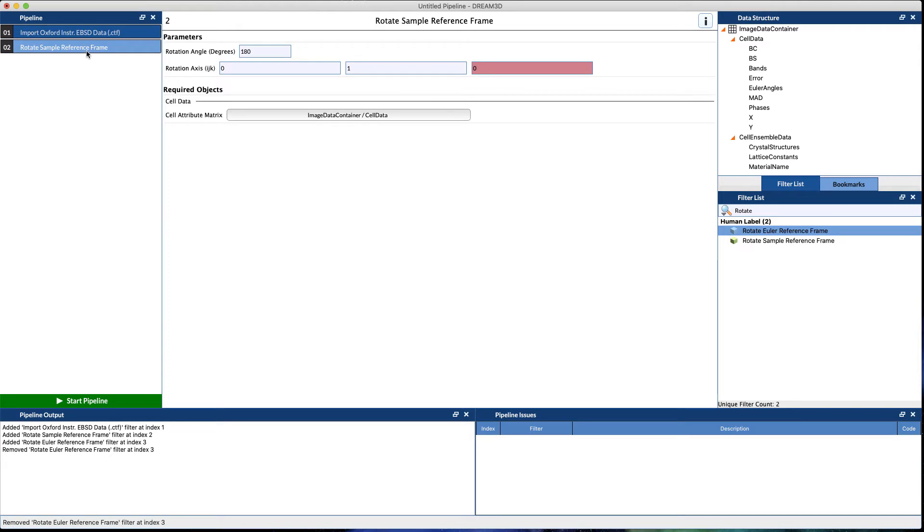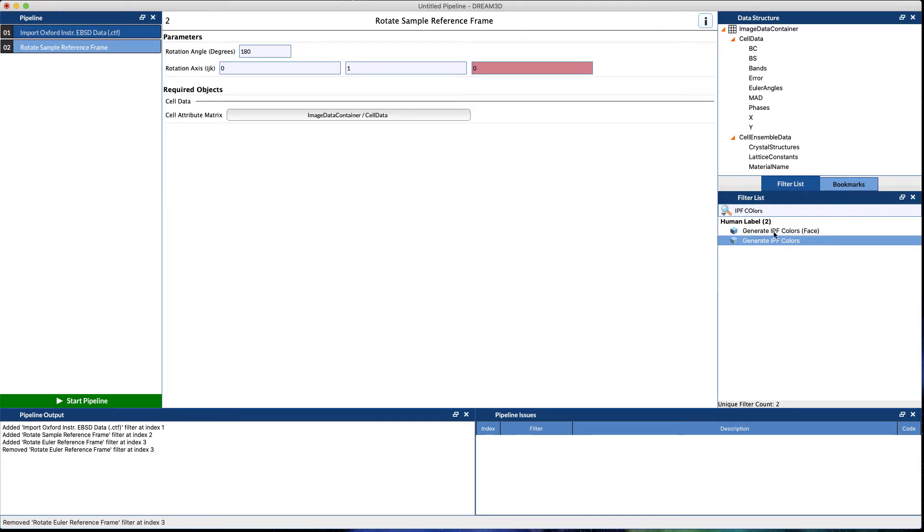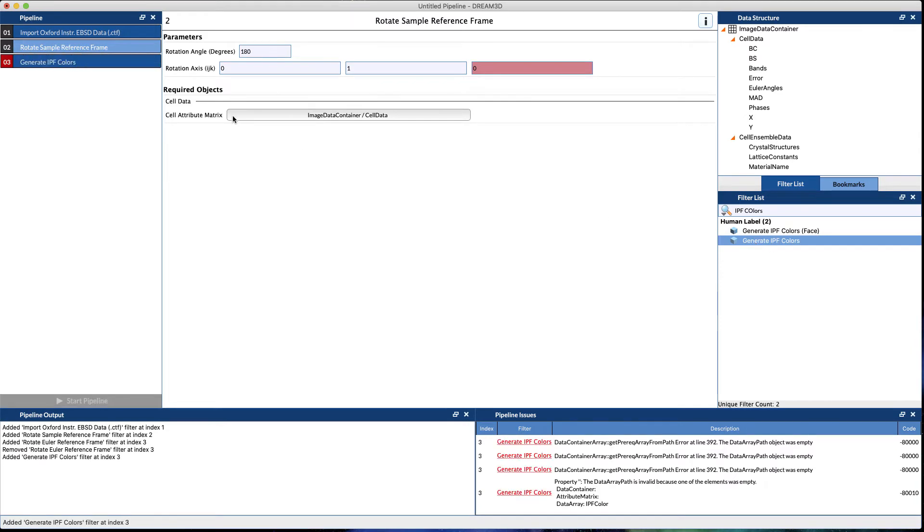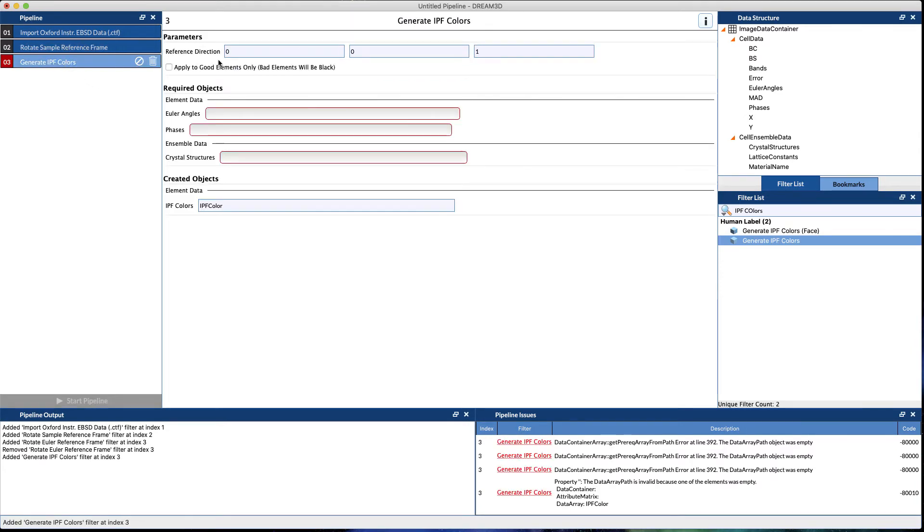Once that correction's done, probably the quickest and easiest thing to do is to generate some IPF colors. You notice we want this one—we don't want the one that says 'face,' that's for something else. IPF Z is the default, so the 001. You can certainly change this to another direction. 100, 010 are typically good.